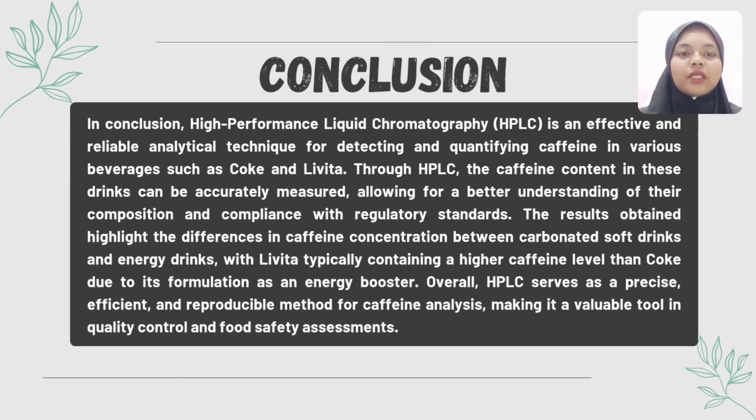The results highlight the difference in caffeine concentration between carbonated soft drinks and energy drinks, with Levita typically containing a higher caffeine level than Coke due to its formulation as an energy booster. Overall, HPLC serves as a precise, efficient, and reproducible method for caffeine analysis, making it a valuable tool in quality control and food safety assessments.